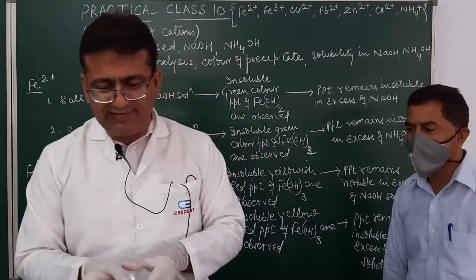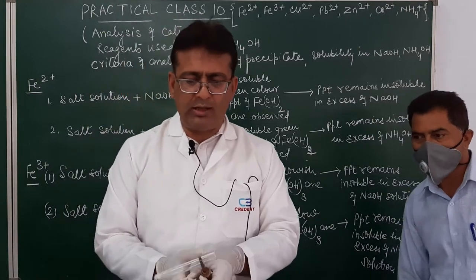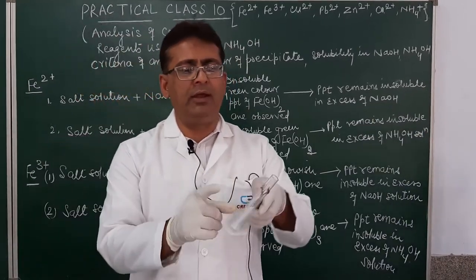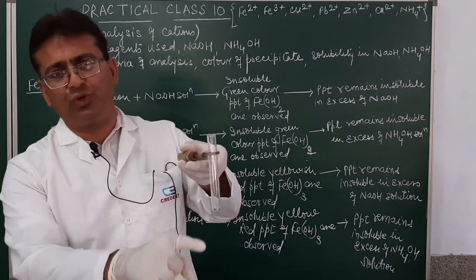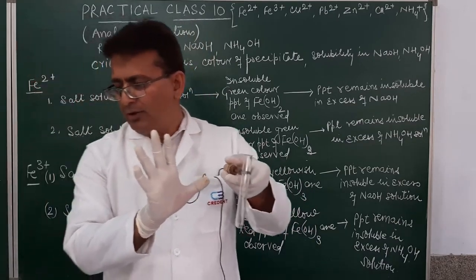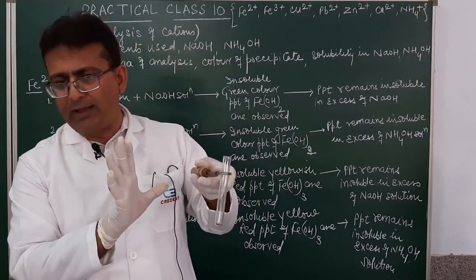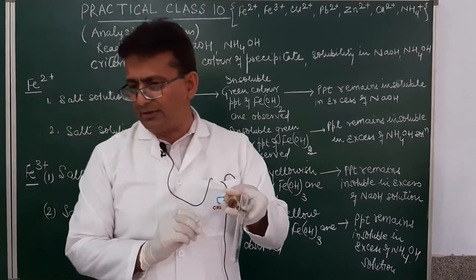Now, this is a test tube holder and a test tube. All of you are very much accustomed with these apparatus in the lab, as we were frequently coming to the lab in class 9th.